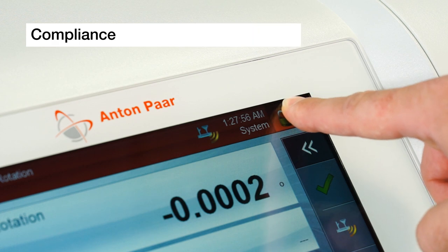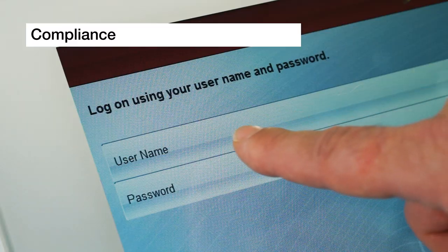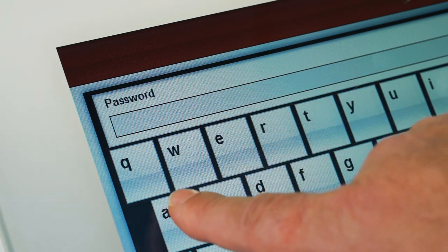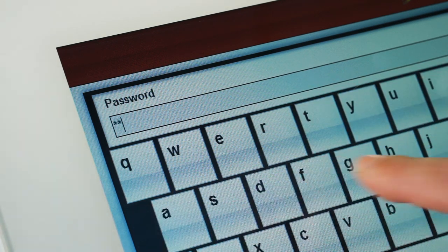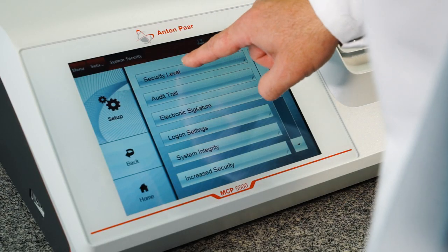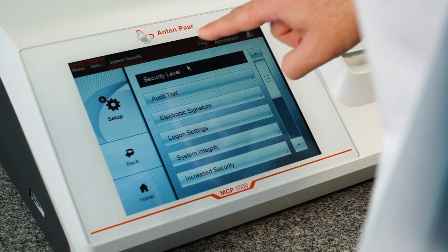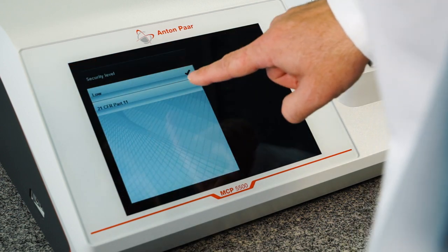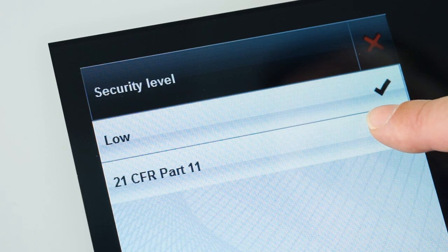For compliant instrument use, the access to the polarimeter user interface is protected by usernames and passwords, allowing only authorized personnel to operate the device. The instrument and all software features ensure compliance to national and international pharmaceutical standards and regulations, especially Pharmacopeia and 21 CFR Part 11.